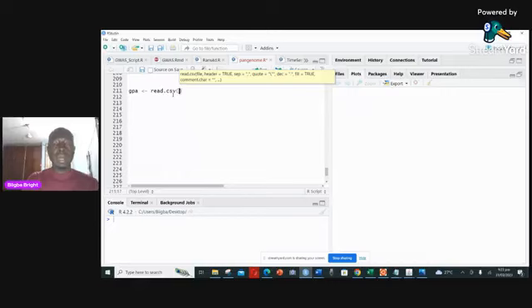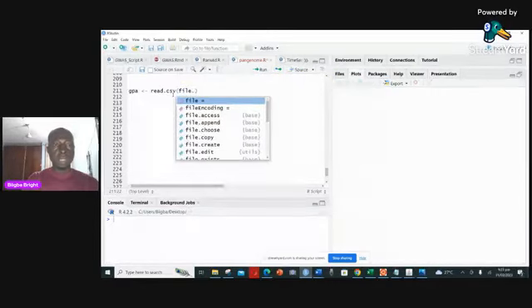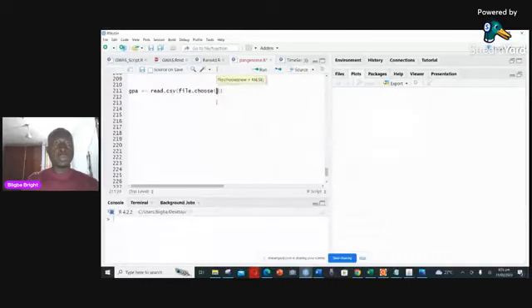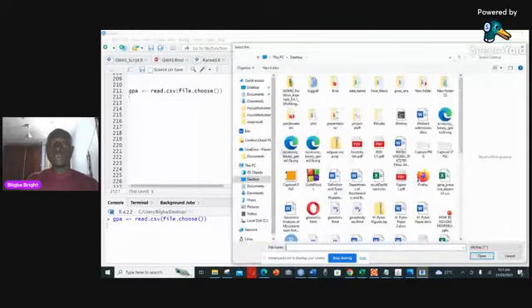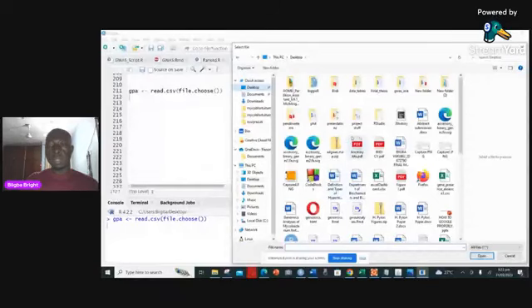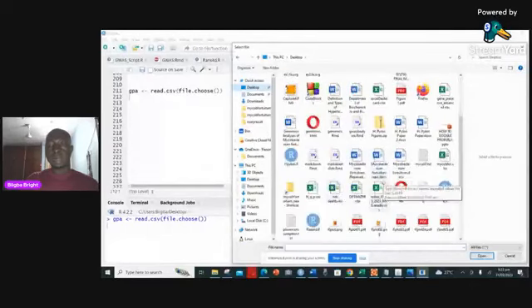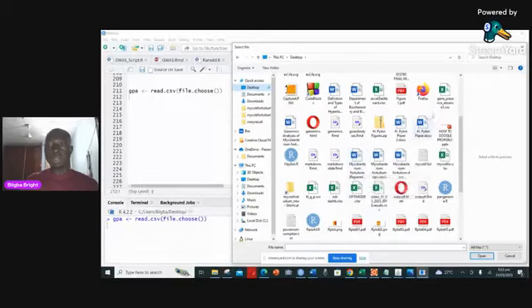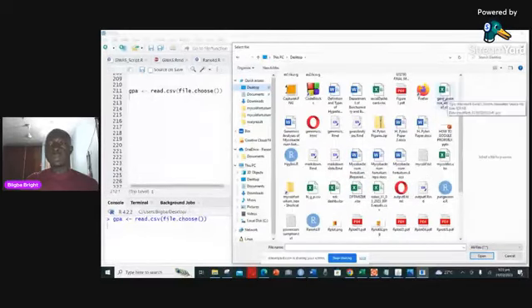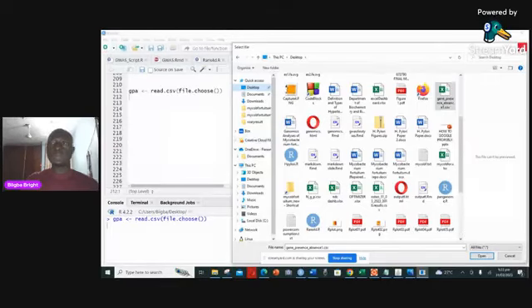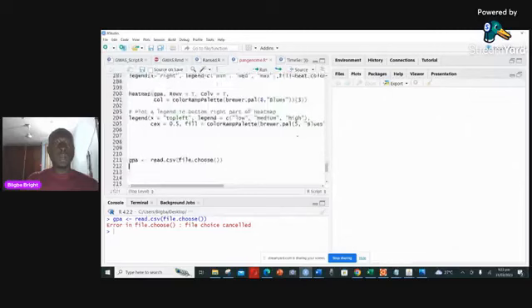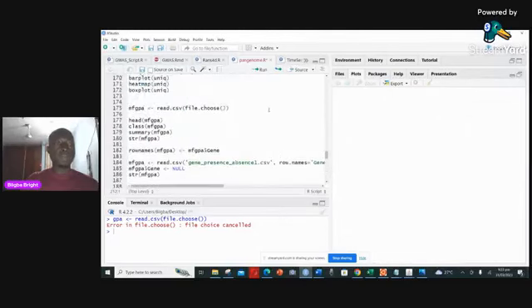If I go to R Studio and I want to bring that particular file in, I just say read.csv, and then file.choose. The file.choose function allows you to browse to your file. It takes you to your desktop where you choose the file. I know I saved it on my desktop, arranged alphabetically, so I go to G, find gene presence and absence, click it and click Open. For the sake of time, I've already done that.